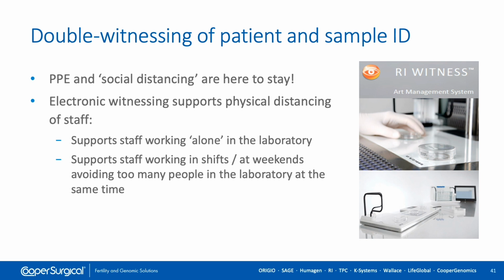The wearing of personal protective equipment and the need for social distancing are here to stay, which presents an impediment to the requirement for double witnessing of patient and sample ID. Electronic witnessing overcomes this problem to a great extent, enabling staff to work alone and minimizes the number of staff required in the laboratory.